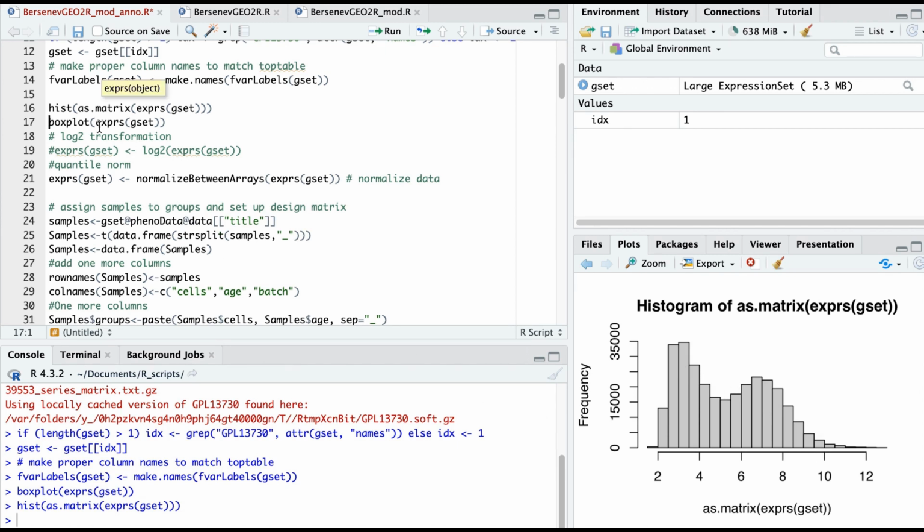Both those figures indicate that your data are already log transformed, and the whole essence of log transformation is not that you need the small numbers, but that you have to get data distribution close to normally distributed data.